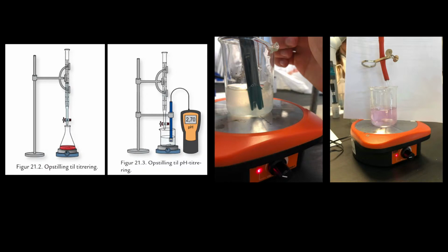I don't really remember, 16.5 I think it was. No, 18. We had an endpoint at about 18 milliliters, so that was pretty close too.